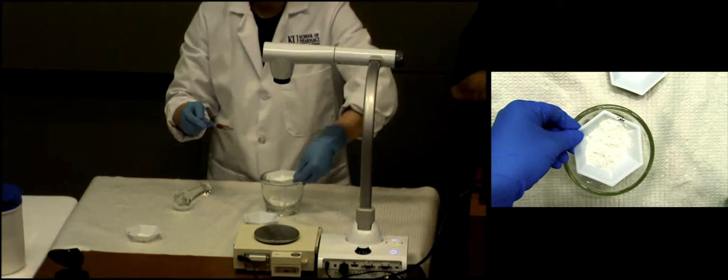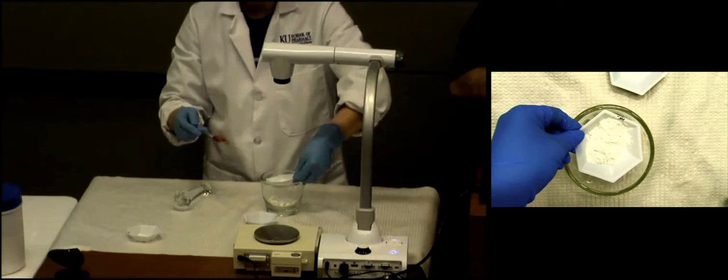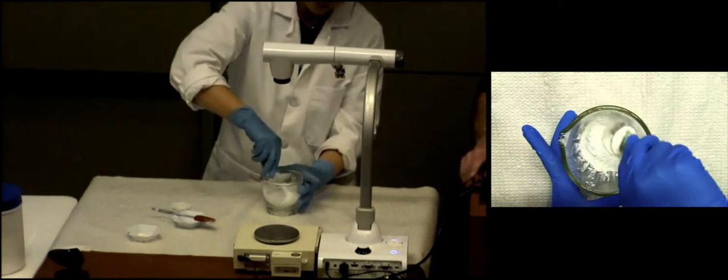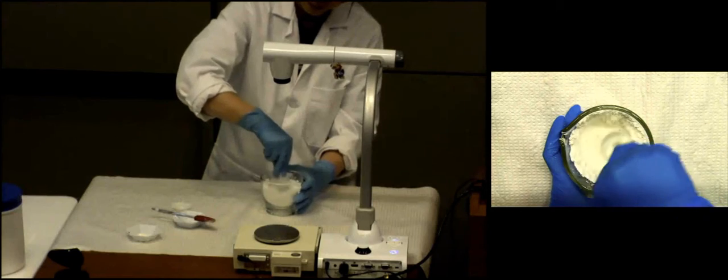Okay. Can I have the second powder go in as well? I could. Remember, it's equal amount, right? So I have double amount there. I can add both of them together. All right. You can see we've got all 4 of them in there.